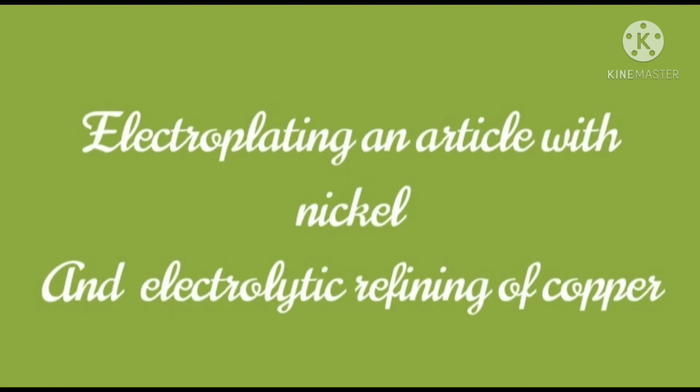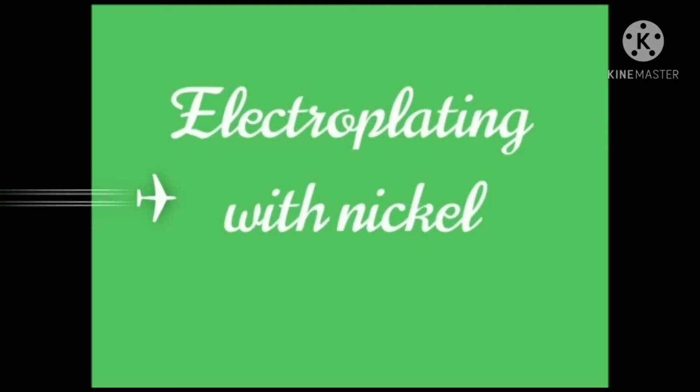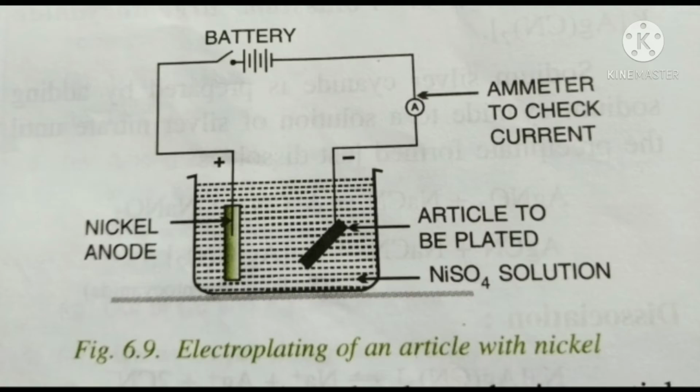In this video, we are going to learn electroplating an article with nickel and electrolytic refining of copper. First, we are going to learn electroplating with nickel. We already studied these conditions for electroplating. Do you remember, children? Yes.